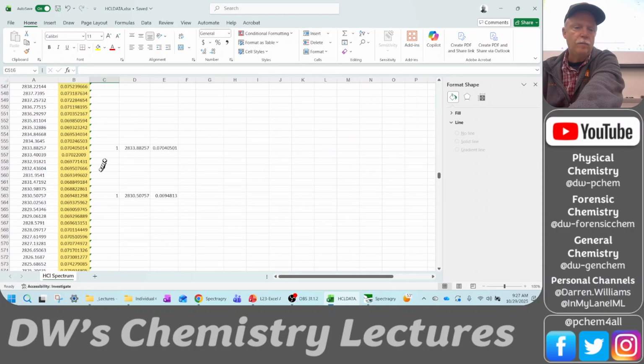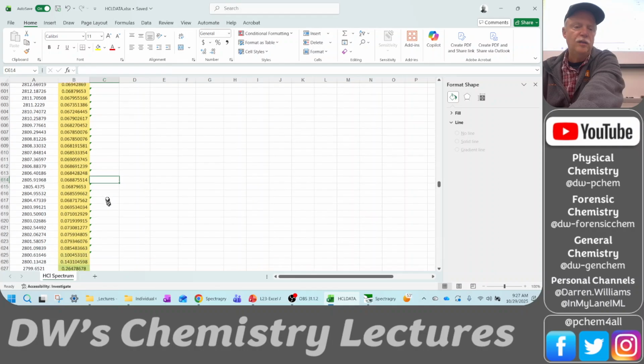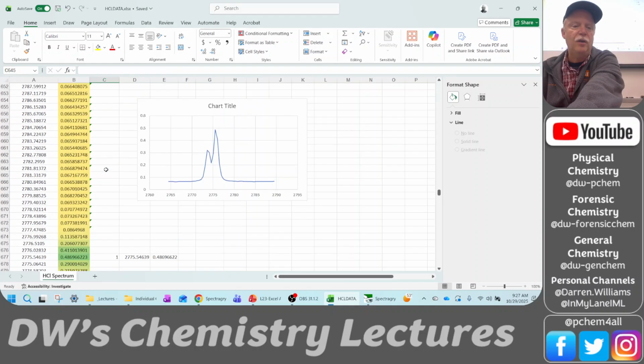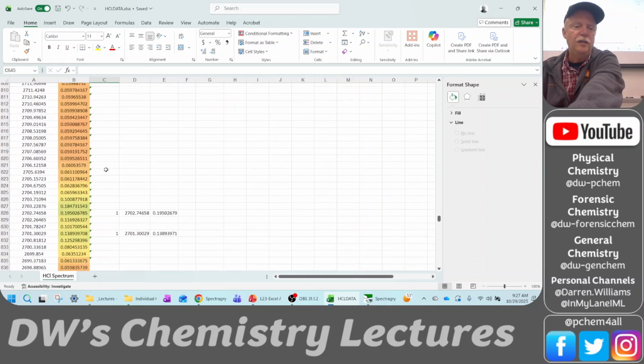Are you just deleting the if statement? Is that how you're, okay. Yeah, and so once the ones disappear, then the criterion fails for copying those things over. So I'm saying if it's a 1, copy over the frequency and the intensity, but if it's not a 1, then don't. And so this is, like I said, tedious, but it's worth it because in the end you'll be done. And this is pretty fast.